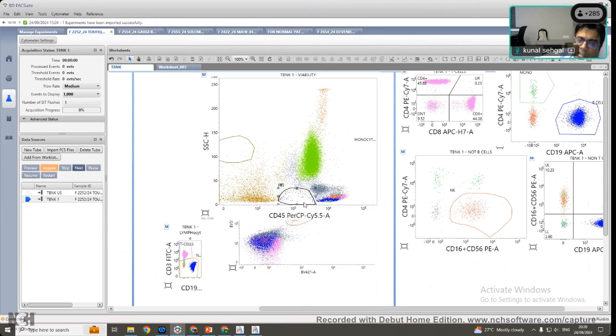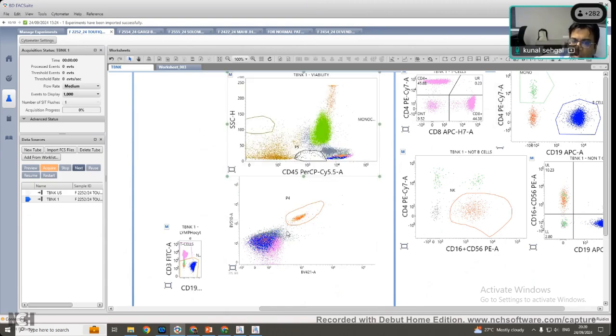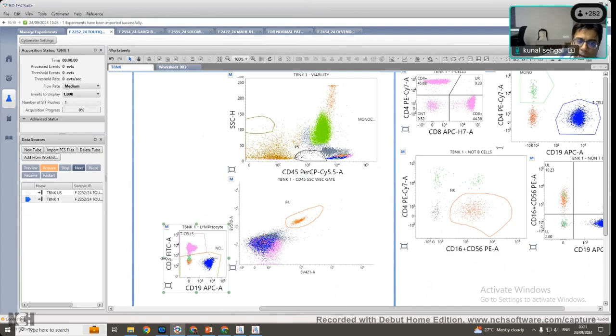It is of extremely important significance to us hematopathologists that you always analyze your progenitors. And that is why the slide which Avinash was showing, with different populations which lie normal and abnormal in the progenitor region, is important for us to do. So in a given sample, we could identify five or six different subsets with a few antibodies and give ourselves an analysis. Any questions or should I move to the other case? Avinash, anything you want to add?